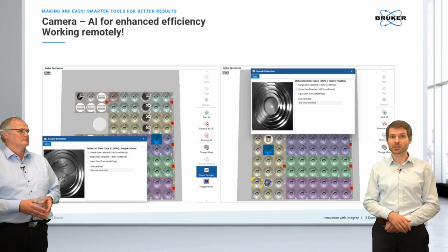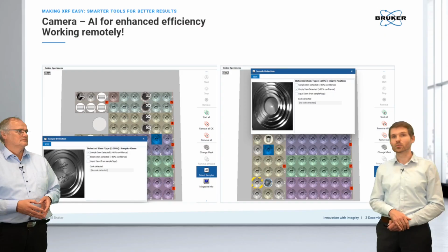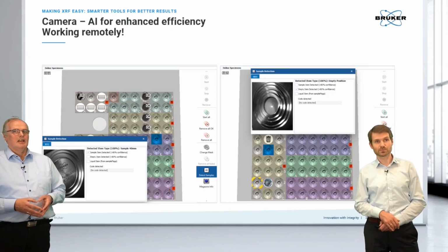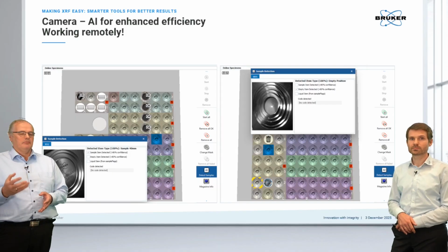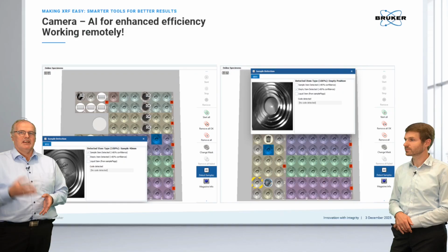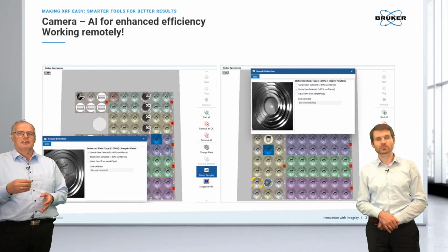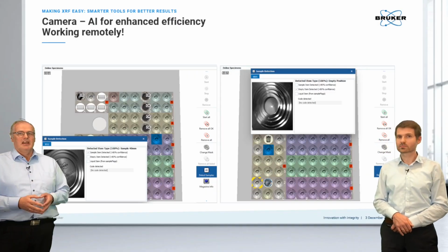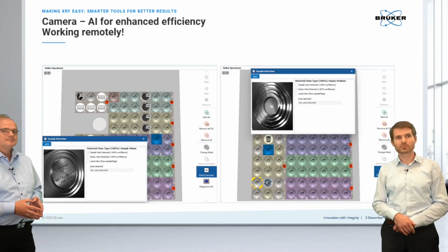And the grabber really helps here, which also can handle all samples, even bare samples, without changing tools, for example. Means actually what I like on this feature, the grabber has a camera inside, and this works simply like your eye. Yeah. Means all the information when we see a sample in a magazine, we actually process a lot of those things, like the size, like the type of sample, like a QR code with a label. And actually the same is now possible with the camera AI.